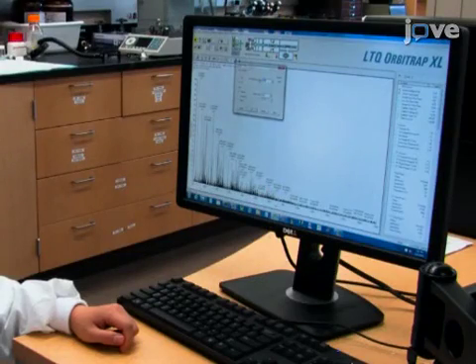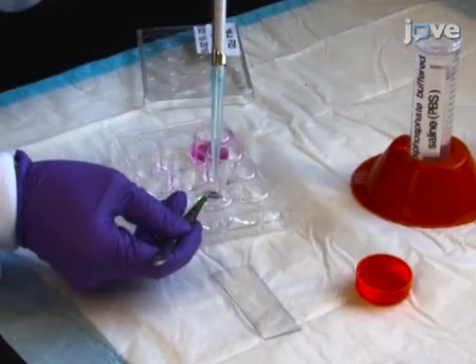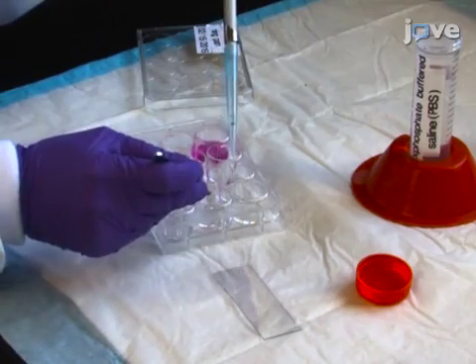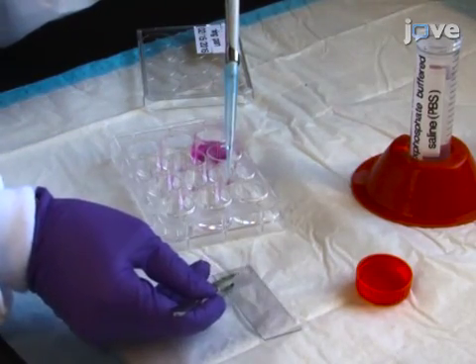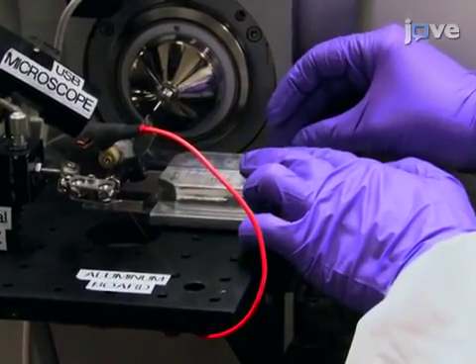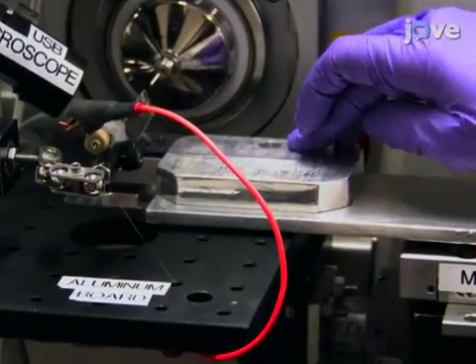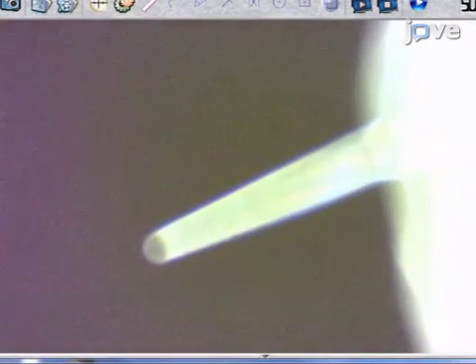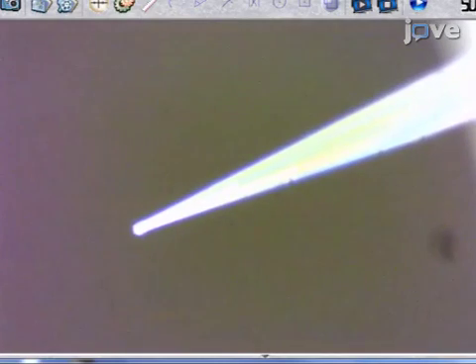Set up the single probe system as per instructions for MSI and adjust the solvent flow rate. Wash the cultured cells attached on the micro cover glass slides with PBS to remove culture media and extracellular drug components. Then place the cell-containing glass slide onto the motorized XYZ translation stage system for the experiment. Focus the digital stereo microscope above the sample onto the tip of the single probe to monitor cell penetration during the analysis.